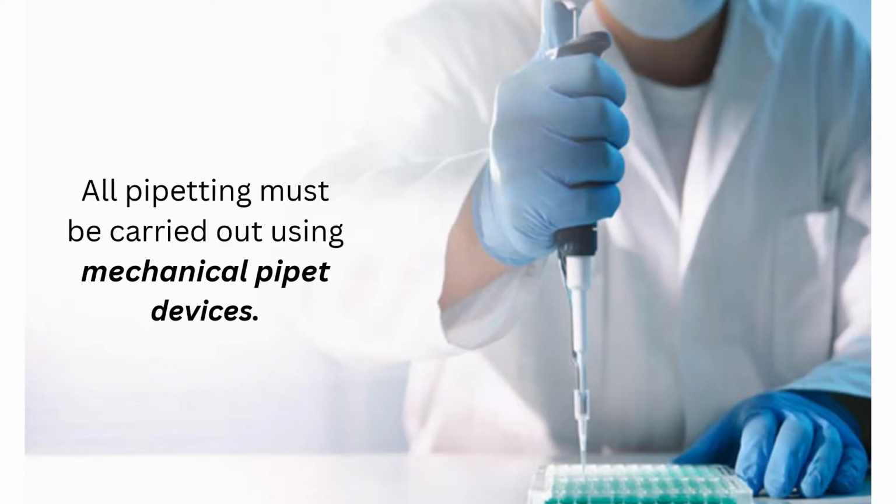All pipetting must be carried out using mechanical pipette devices. Do not worry, class, we will be having a separate laboratory activity regarding pipetting so that you can also practice and have a grasp on how to properly hold your pipettes and at the same time dispense the fluids using the pipettes.